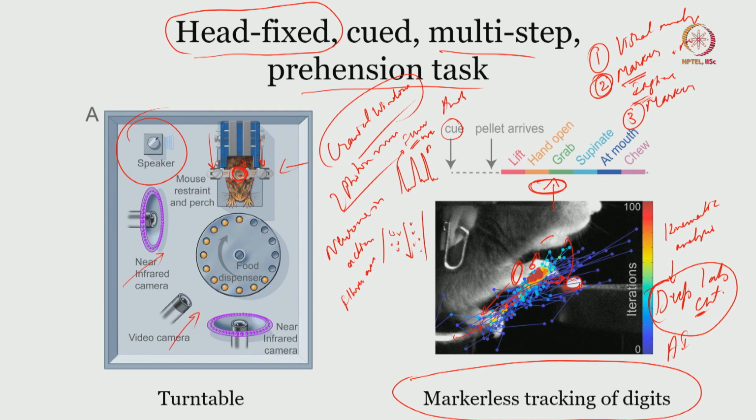You have data to train on and say these are the markers I am going to use, by the anatomy, by the position of the limb, and once that training is done, the software automatically analyzes the trajectory, as shown in this picture here.